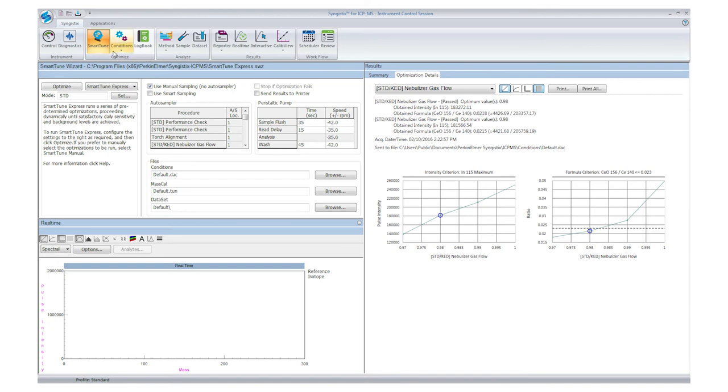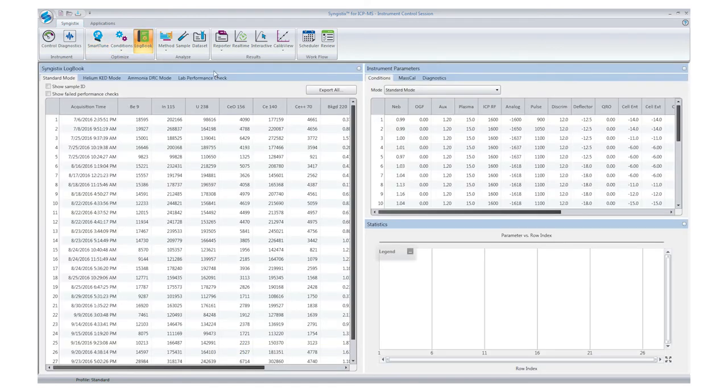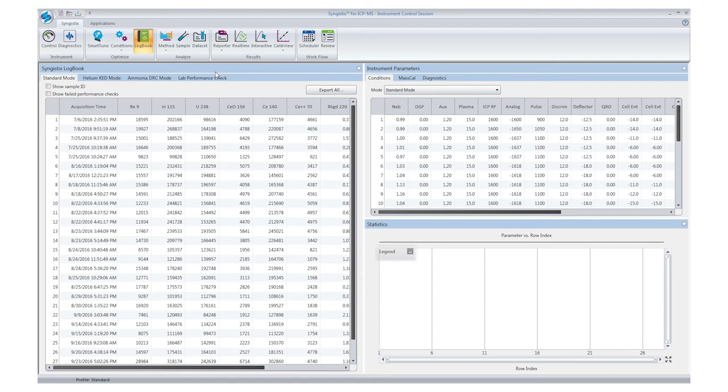The Syngistics logbook stores the results of the optimization, together with all of the relevant instrument parameters used in each optimization. This creates a continuous performance history of the instrument, which you can use to track instrument performance trends over time and to potentially troubleshoot any problems.